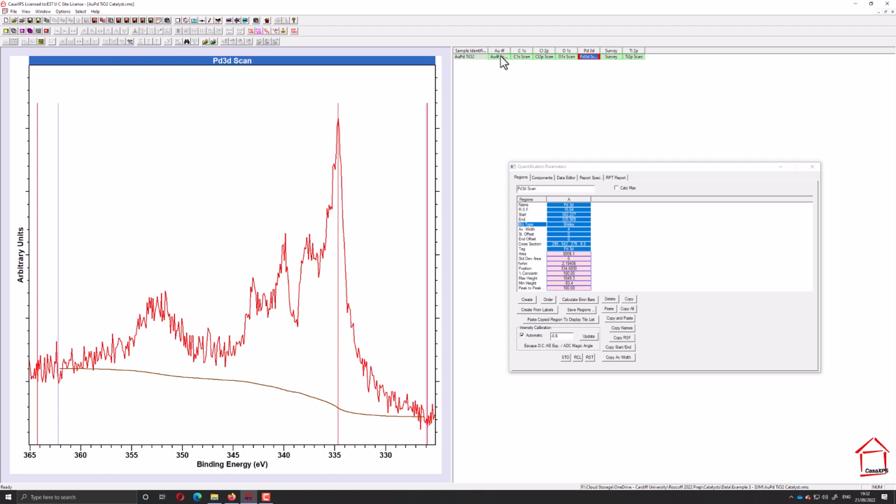And we can also check, because the nanoparticles with this sol preparation are all below 10 nanometers. I think if I recall correctly, the range is somewhere in the region of 5 to 7 or 8 nanometers, a very narrow distribution. So just recall, XPS is seeing the average signal, and therefore we're seeing the average signal of all those particles.